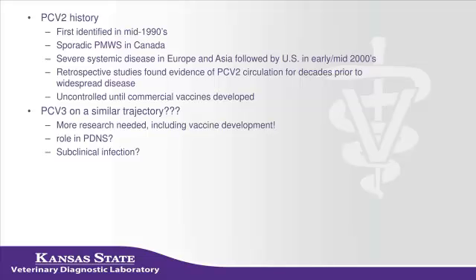So, of all the viruses that we've found over the years, this is the one I think we should pay attention to, and we need to be proactive about. Really, because it's on a similar trajectory. It's similar to canine circovirus, porcine circovirus. This thing certainly has potential to cause disease. Some of these questions: 12.5% of samples were positive. What's the role of subclinical infection?